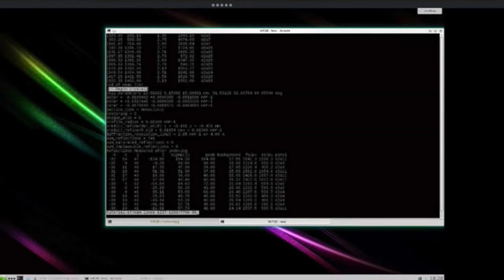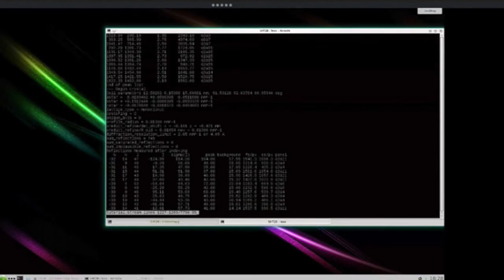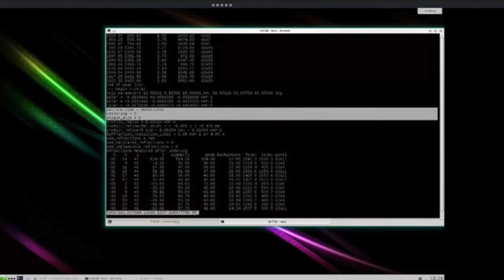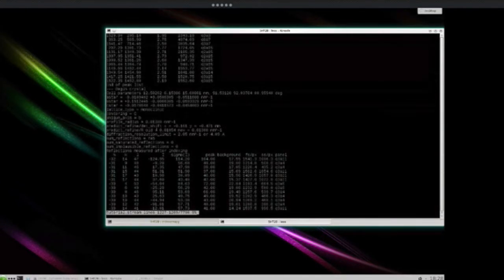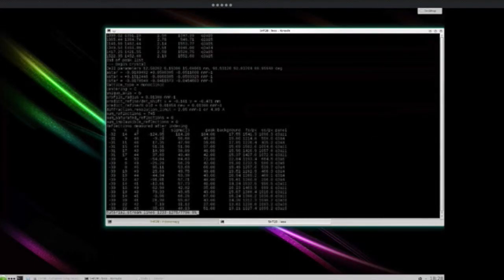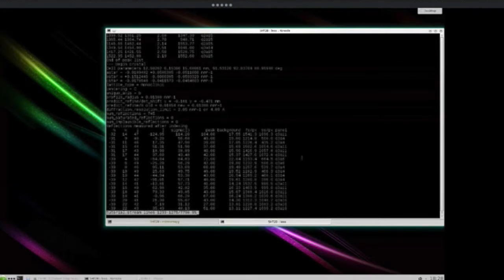So we have begin crystal, marking the beginning of the crystal. It's followed by the cell parameters for that crystal, unit cell parameters. The reciprocal lattice basis vectors. It thinks that it's monoclinic C-centered with a unique axis B. So we'll see if that's right later on. There are the reflections themselves, HKL, I, sigma I, and so on. Position of the peak as well.